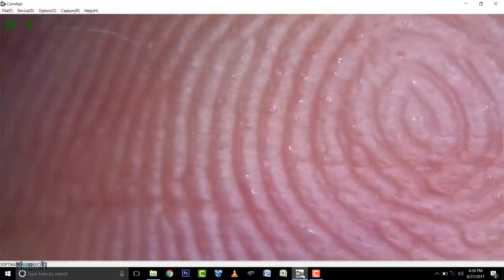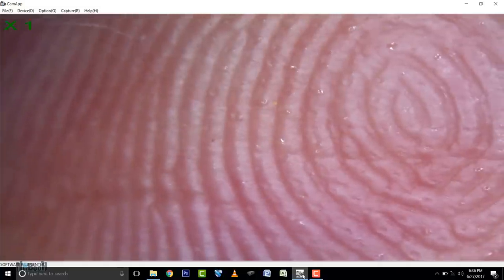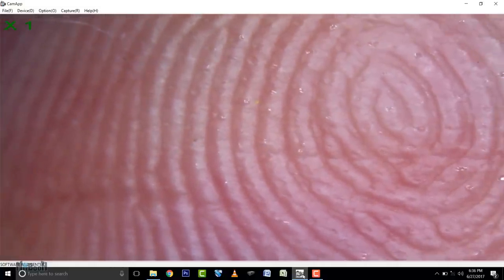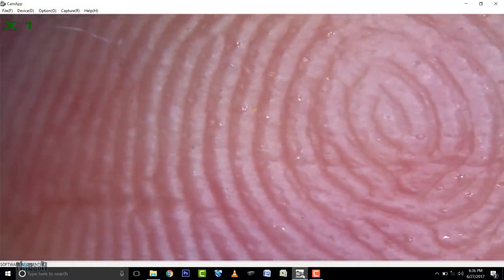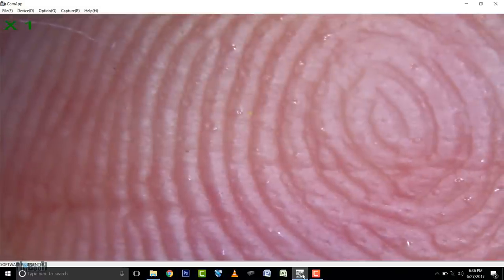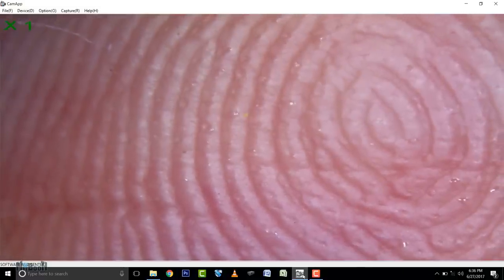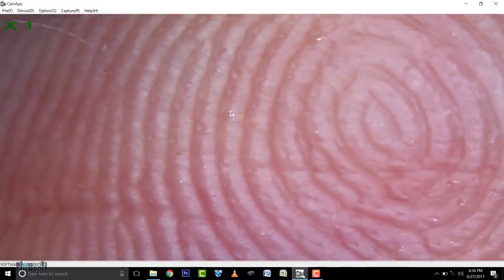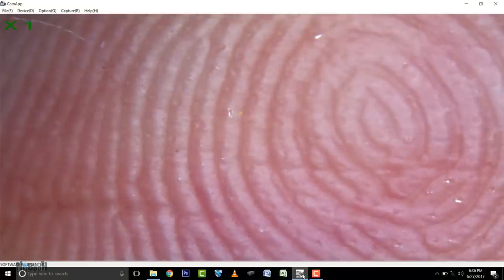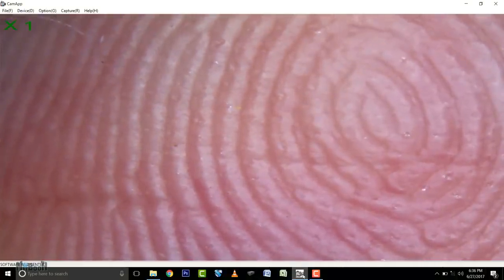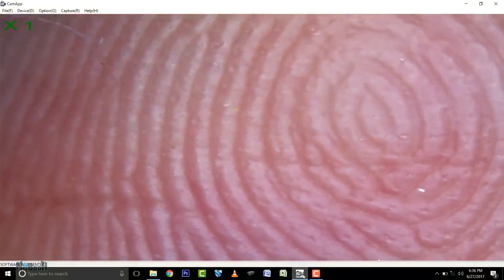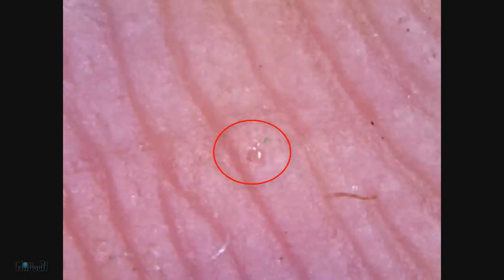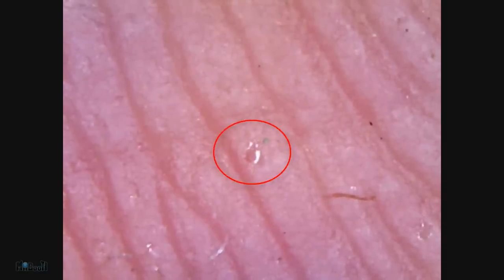Next up, human skin, finger to be specific. Look at this fingerprint. Look at how huge the ridges are looking. If you notice carefully, you can see tiny little holes on the surface of each of the ridges. These are sweat pores, and here you can see them pushing out sweat in the form of tiny droplets.